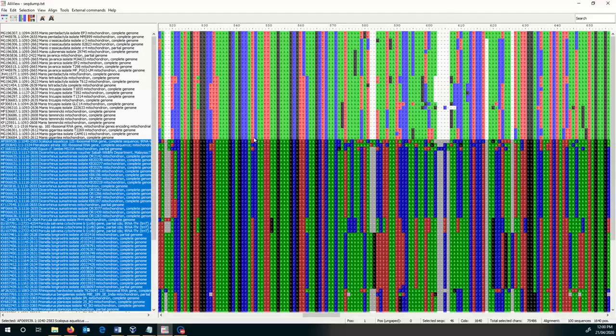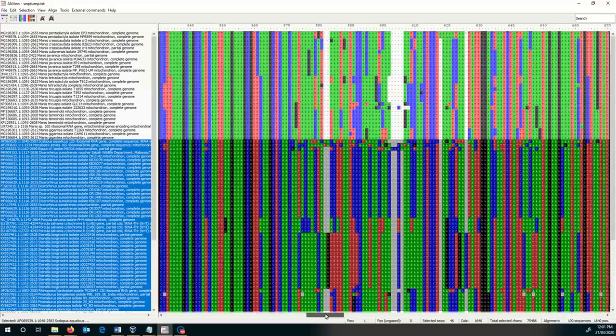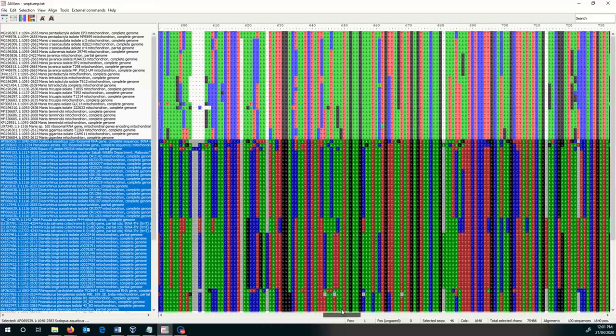Good. It's starting to look all right. Yeah, it's a little bit tricky. Actually, let me continue. I need to jump into it right now. Let me pause the video for a minute. You can see that I'm thinking about this, and I'm going to scroll through this and come back to it in a moment when hopefully I've found some good regions.